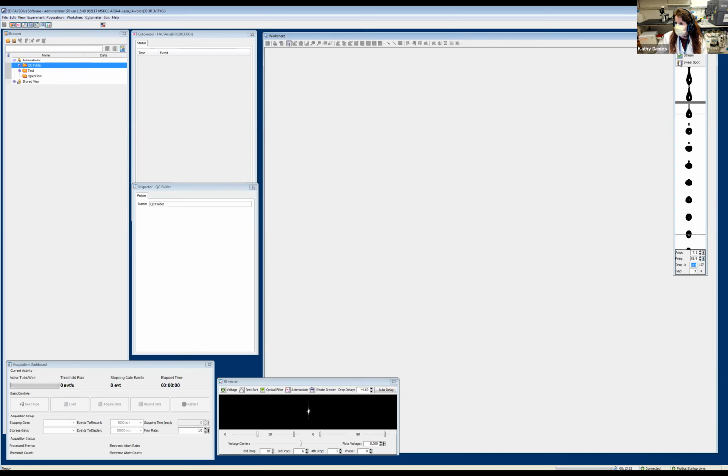My 2 options are either to turn on sweet spot, and that sweet spot is going to try and, again, get it to these predefined values that I have in. And what you can see is as I hit that sweet spot, it adjusts this amplitude automatically in the software to get as close as possible. And it did it fairly quickly. Now, I tend to be a little impatient, because I've been working at the cytometer for so long, so what I'll default to is making minor tweaks to this amplitude to get it as close as possible, and then I'll turn the sweet spot on.